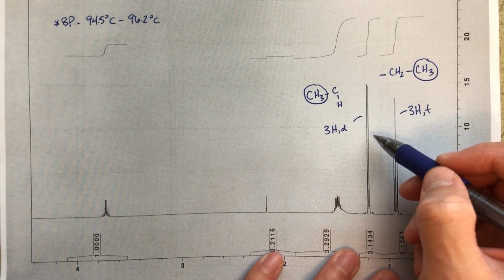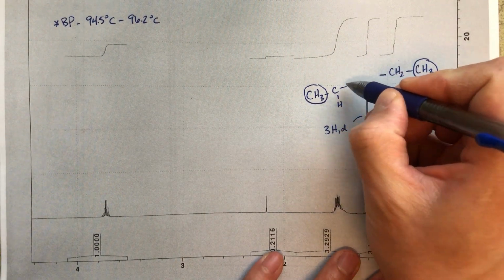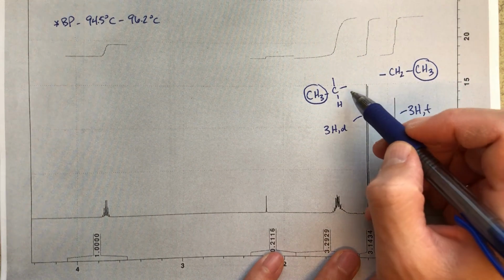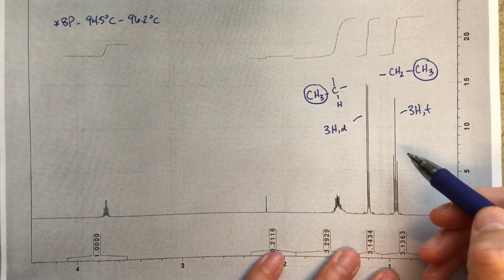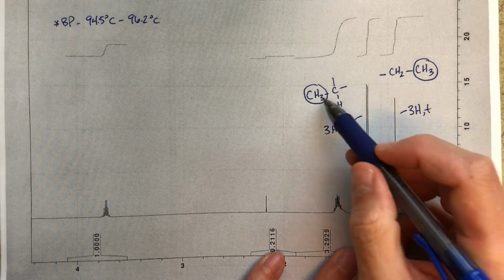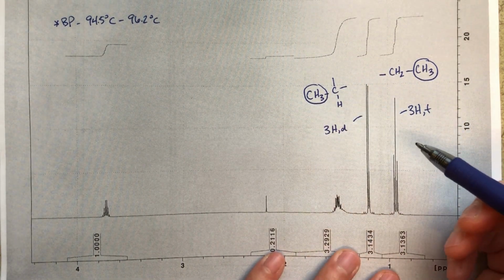That's how we get to this doublet, is that I've got an adjacent carbon with just 1 hydrogen. And then I've got other things going off over here, maybe alcohol, hint, hint, or another carbon over here. It could be 2 carbon groups as well. But something like this is indicating that we've got this 3-high doublet. That's how we'd get there. So again, we've got another piece of our puzzle here.